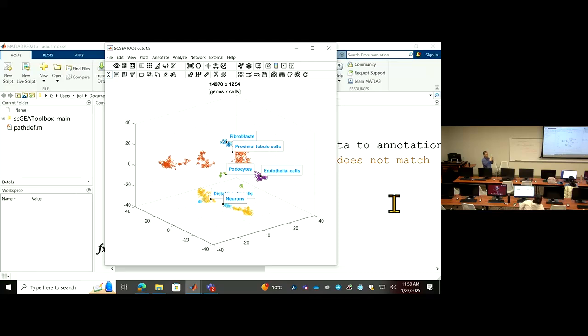How genes regulate each other is different from one cell type to another. Then if you have two samples, how are you going to compare the gene regulatory network from one sample with another for a given cell type? We have pseudo-time analysis, where we align cells from undifferentiated or differentiated or different states.